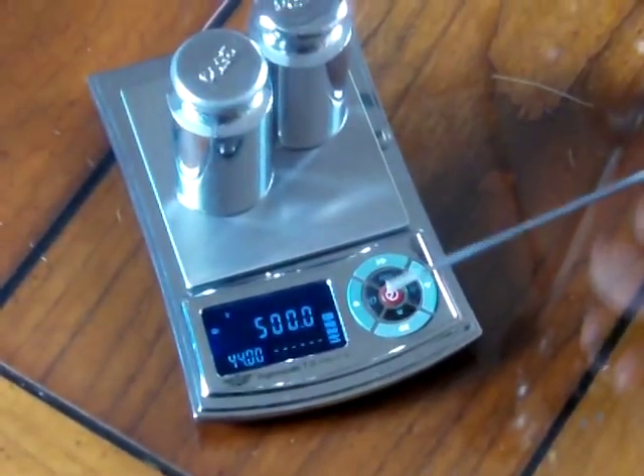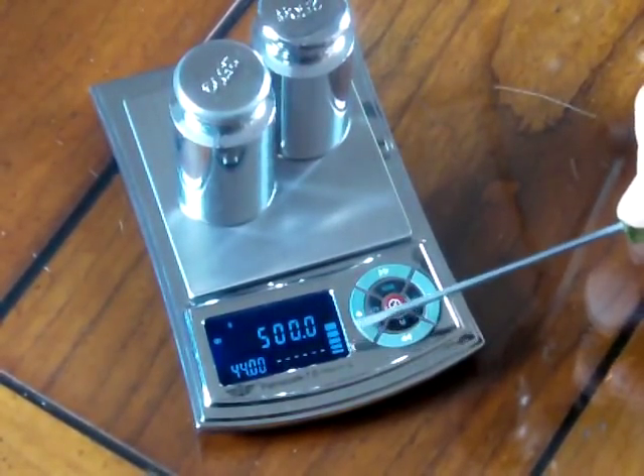You'll also notice on the left-hand corner of the display, MyWeigh has this weight meter. Basically it's like halfway up, and if I apply more weight you'll see it goes higher. And if I go all the way, it says 'Overload' at the very top. So that's a real nice unique feature with the MyWeigh Palm Scale 7. It has the weight meter. If you'd like to purchase this, go to Balances.com — we're an authorized MyWeigh dealer.